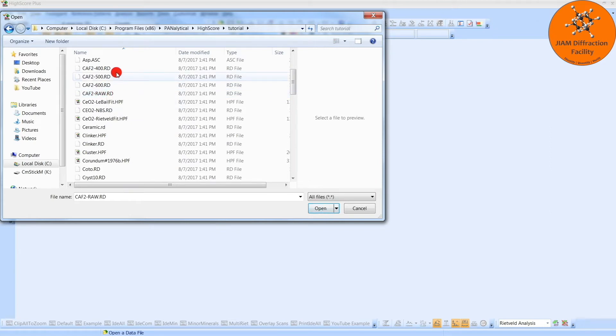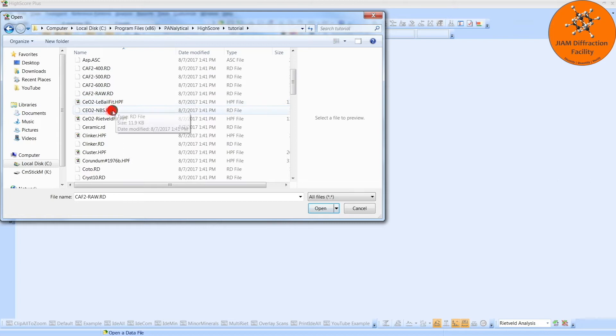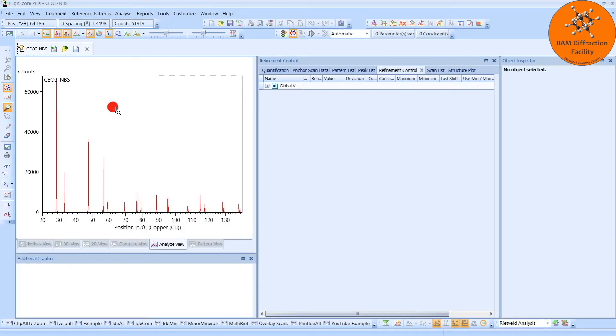If you want, you can analyze the 400, 500, and 600 degree annealed samples. But to start, we will use the Cerium Oxide-NBS in order to get our instrumental broadening. Now, before we begin, I just want to make it abundantly clear that if you want to analyze your own samples, you would not use this file.